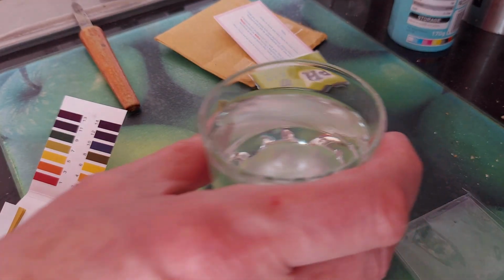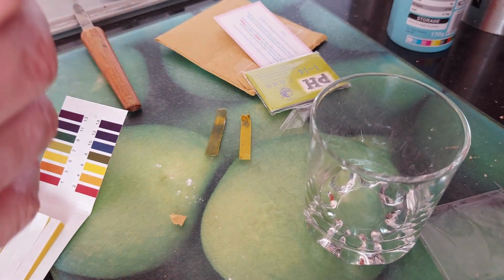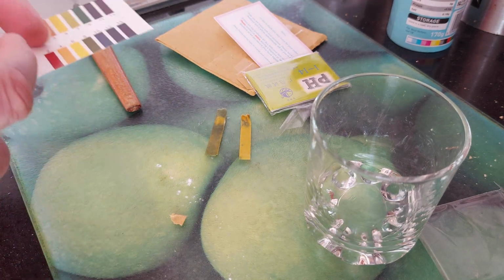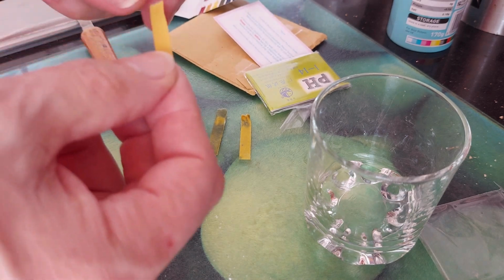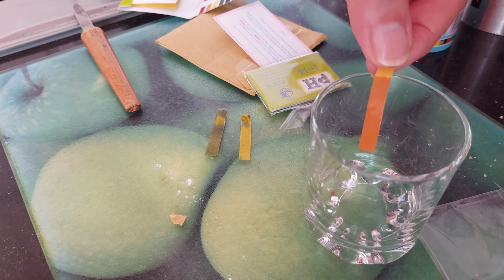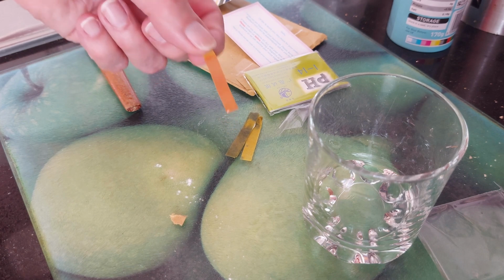Right, we'll just tip that out again. I will just try a little bit of vinegar direct. Right, a little bit of vinegar. Another one of these. It really ought to go red. Yeah, I would say that was red-ish. Certainly the most red out of all the ones we've tried so far, compared to the green one.